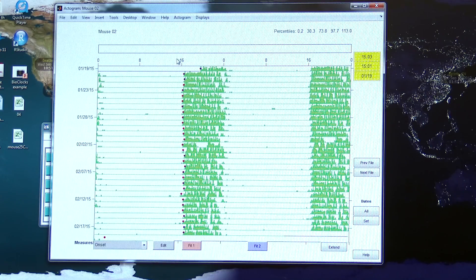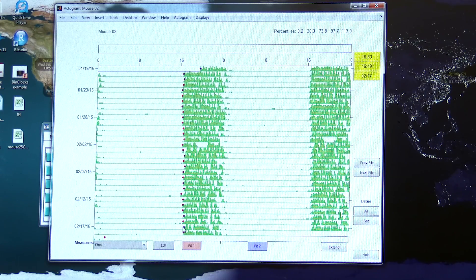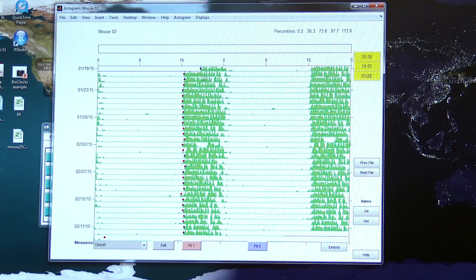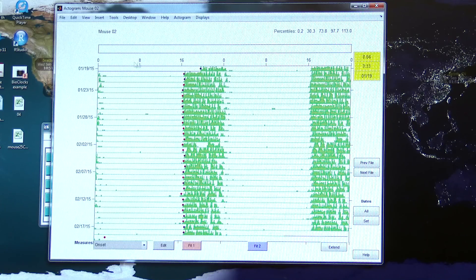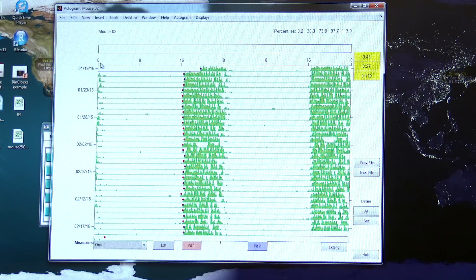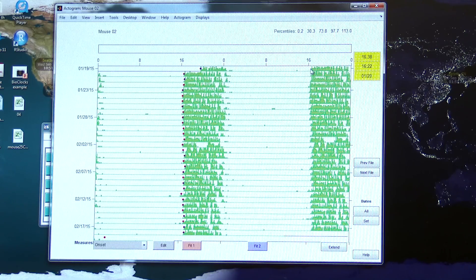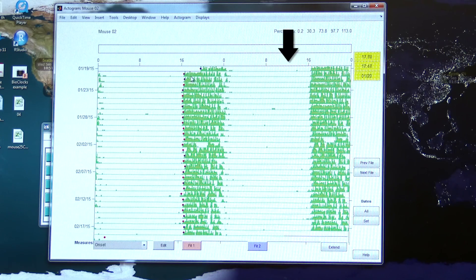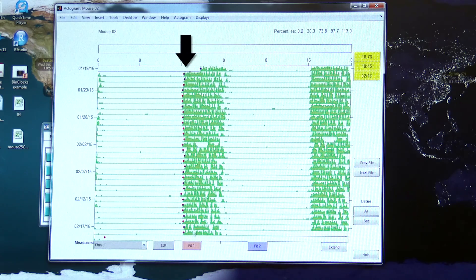When we look at circadian rhythms we tend to plot the data over 48 hours. Each of the data points on here appears twice. This data point here also appears here.